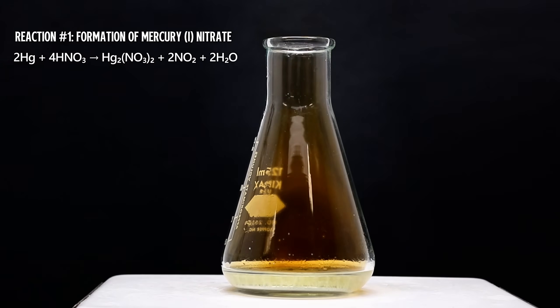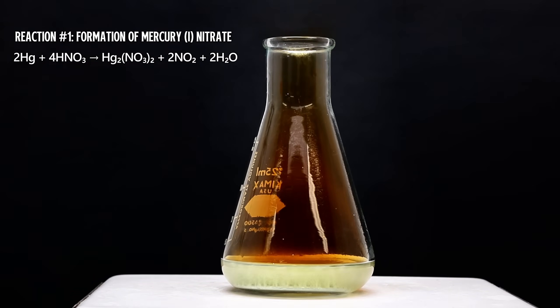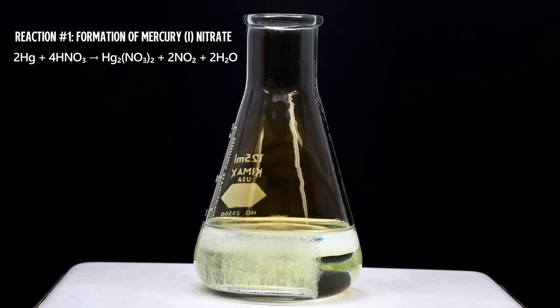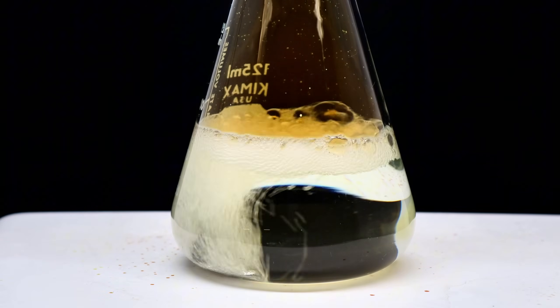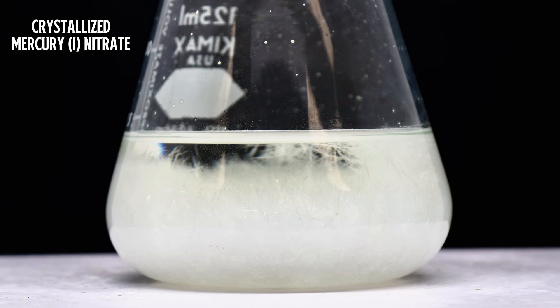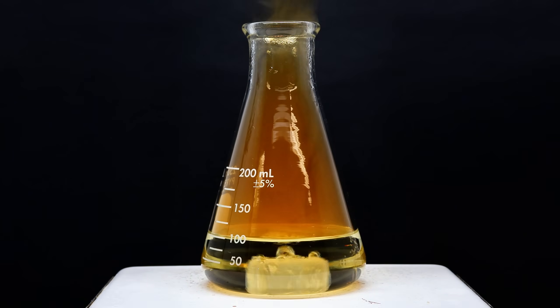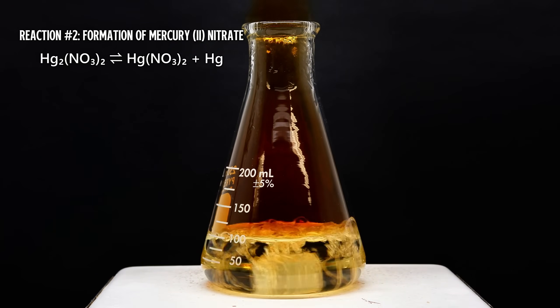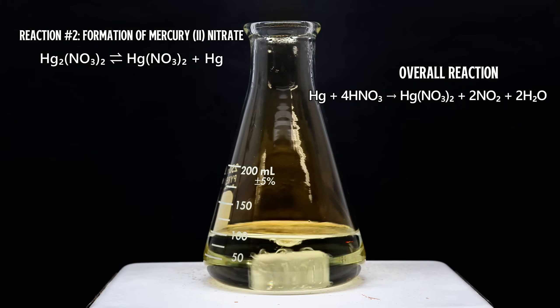The reaction going on here takes place in two steps. In the first step, mercury is oxidized by nitric acid, forming mercury-1-nitrate. Mercury-1-nitrate is far less soluble than mercury-2-nitrate, and will actually crystallize if I allow this to cool as soon as all the mercury is done dissolving. To make mercury-2-thiocyanate, I need mercury-2-nitrate, so to further oxidize my mercury-1-nitrate to mercury-2-nitrate, I simply add more nitric acid and slowly bring the mixture back up to a boil. The applied heat will cause mercury-1-nitrate to disproportionate to mercury-2-nitrate and elemental mercury, which will immediately react with excess acid and repeat the process.